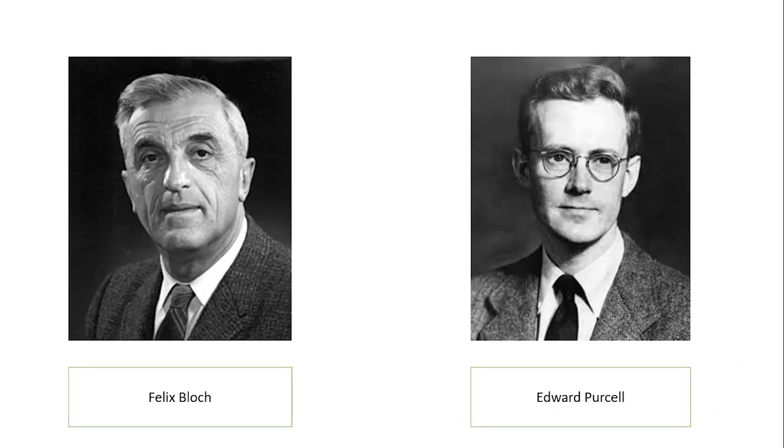Felix Bloch developed a technique to measure nuclear magnetic moments in liquids and solids, demonstrating how nuclei in a magnetic field could absorb and emit electromagnetic radiation at a specific resonance frequency. He introduced the concept of magnetic induction to measure the response of atomic nuclei to magnetic fields, which allowed the detection of NMR signal in bulk materials. Edward Purcell did the same for paraffin.